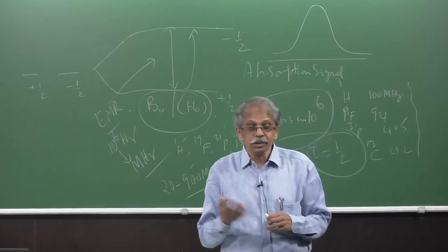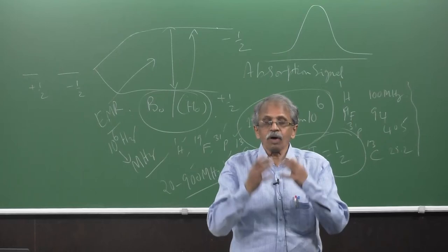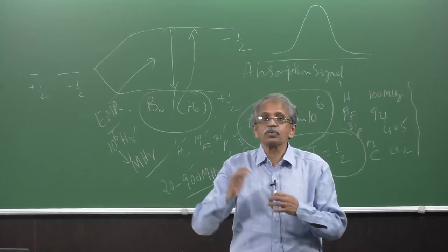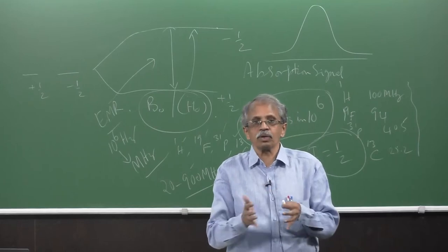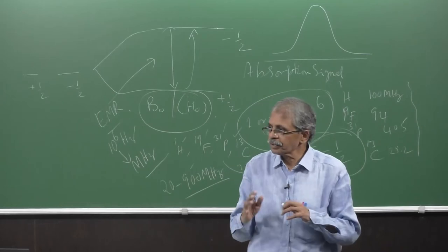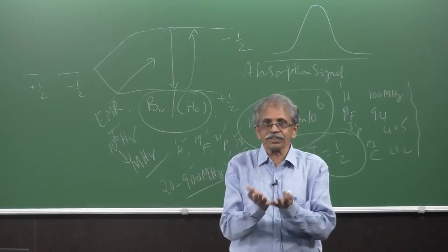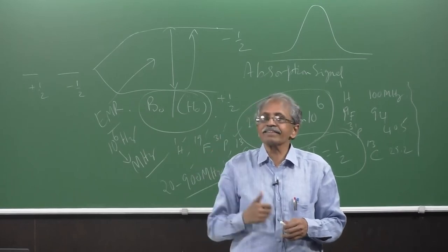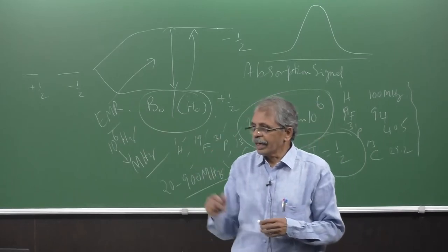That means, for all nuclei of a molecule, let's say a molecule containing different kinds of carbons, will they all absorb at the same frequency? If they all absorb at the same frequency, this technique is of no use at all. You cannot get any information. Or will all hydrogens present in an organic molecule absorb at one frequency? No, that means something else is happening as well.